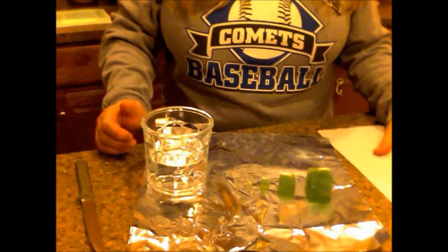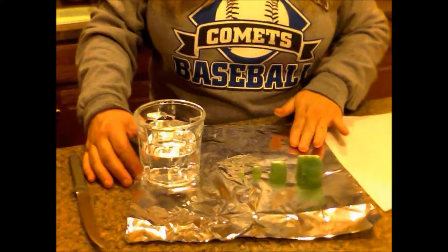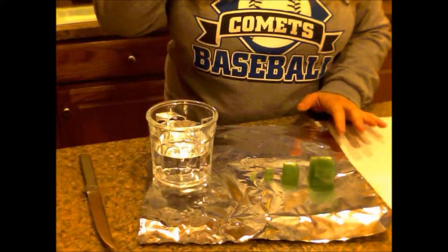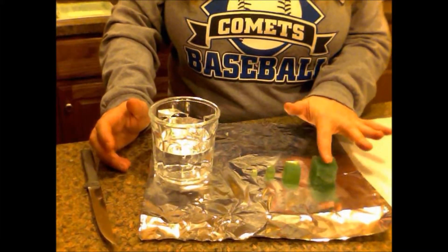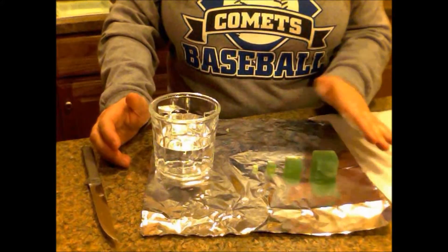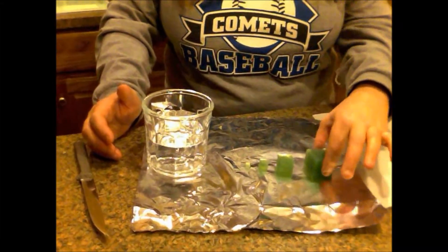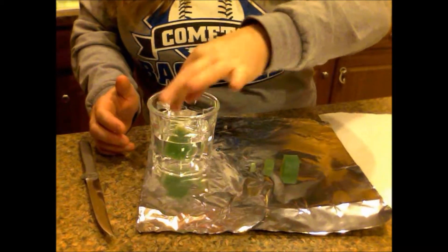Once you have your four blocks cut and ready to go, we are then going to place each block individually into a beaker or cup of white vinegar. Remember, these blocks are colored with the universal indicator which will turn color in vinegar, which is an acid. I'm going to start with the large block — just completely submerge it in the vinegar and you should have a stopwatch ready to go.